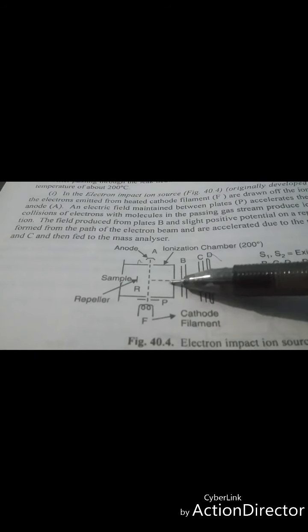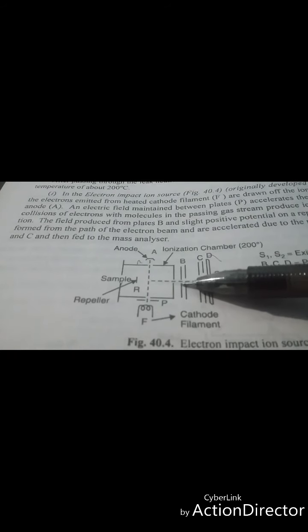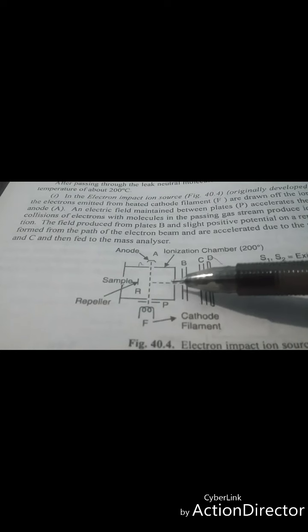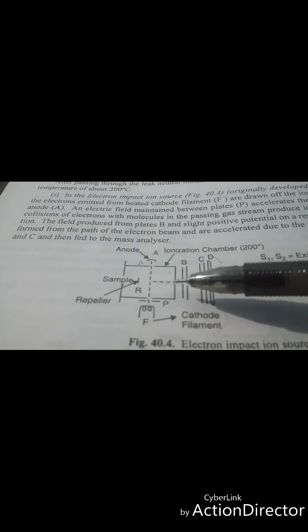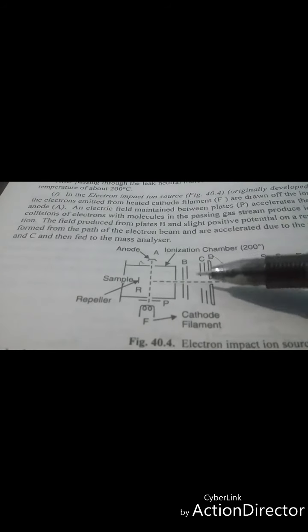The field produced by plate B and a slight positive potential of the repeller R will remove the ions formed from the path of the electron beam, and they will be accelerated due to the potential difference between plates B and C, and then fed to the mass analyzer.